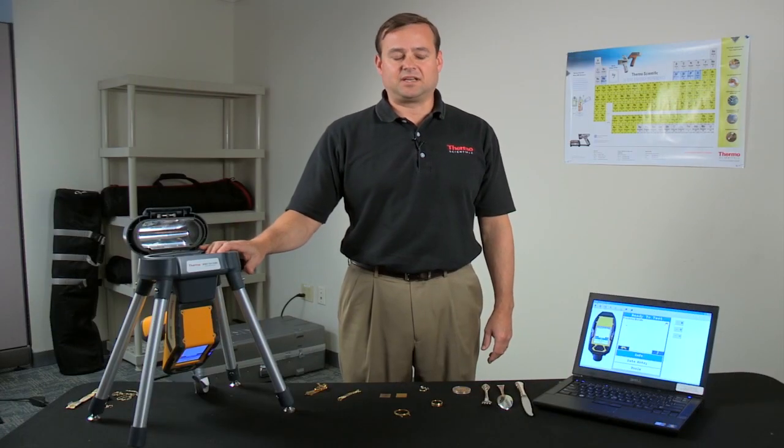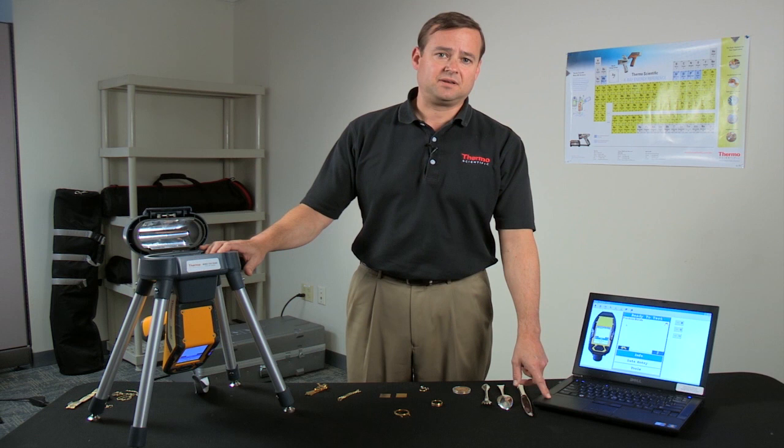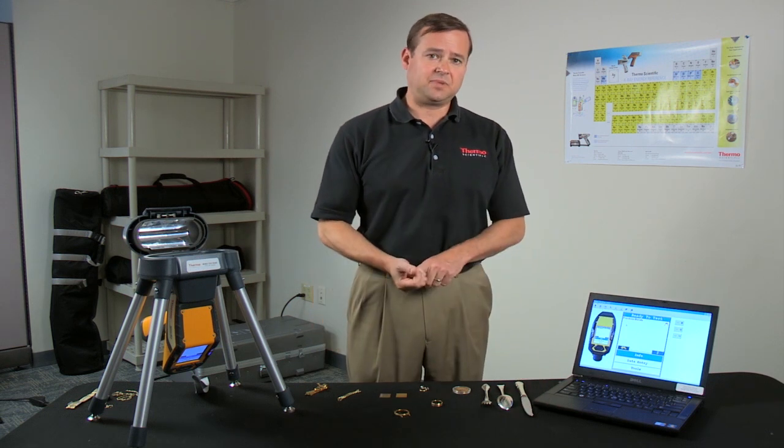Now when the analyzer is docked into a test stand, it's best to run it on a PC. And you have two options, either USB or Bluetooth.